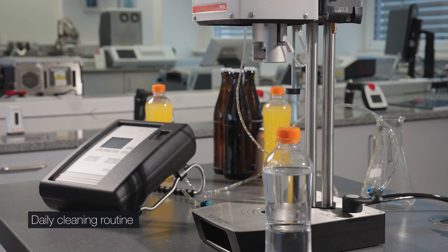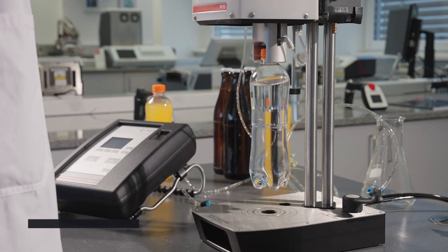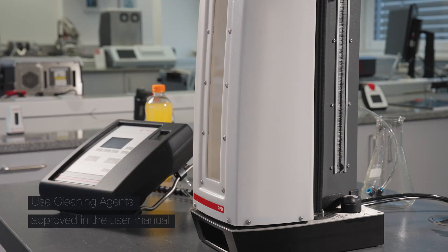Clean the instrument daily using laboratory cleaner. First, insert a bottle with purified water and rinse with approximately 300 milliliters. Repeat the rinsing procedure with cleaning agent and two bottles of purified water.